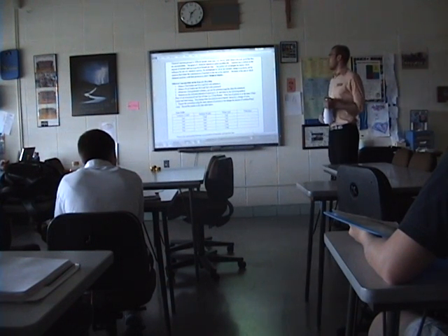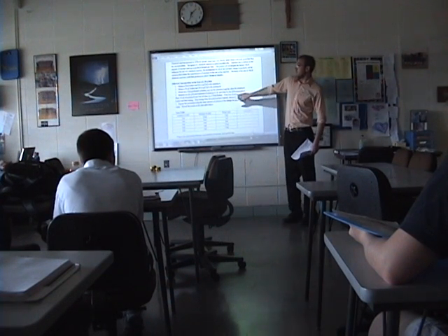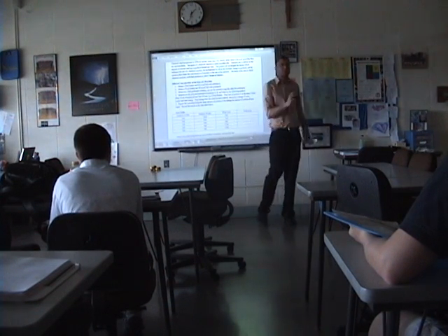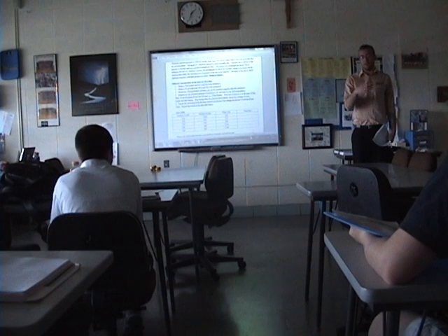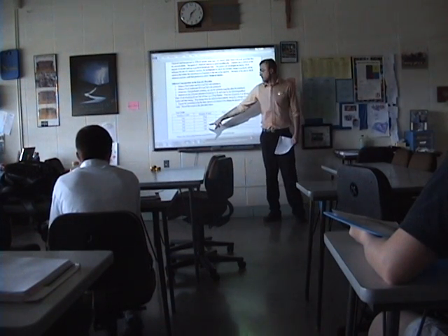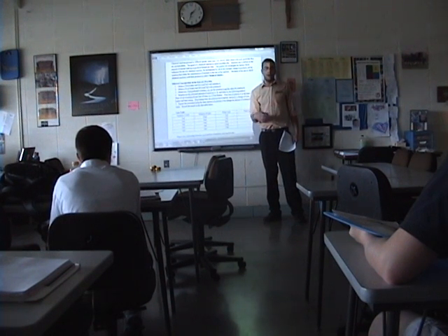And then from there, to start, you can read number 4. It says you're going to put the solution B and the water initially into your big 250 ml beaker first. And then to that, you're going to add your solution A. So you're going to have different concentrations of solution B and water, and that's going to initially go into this big beaker that's going to have your reaction occurring.